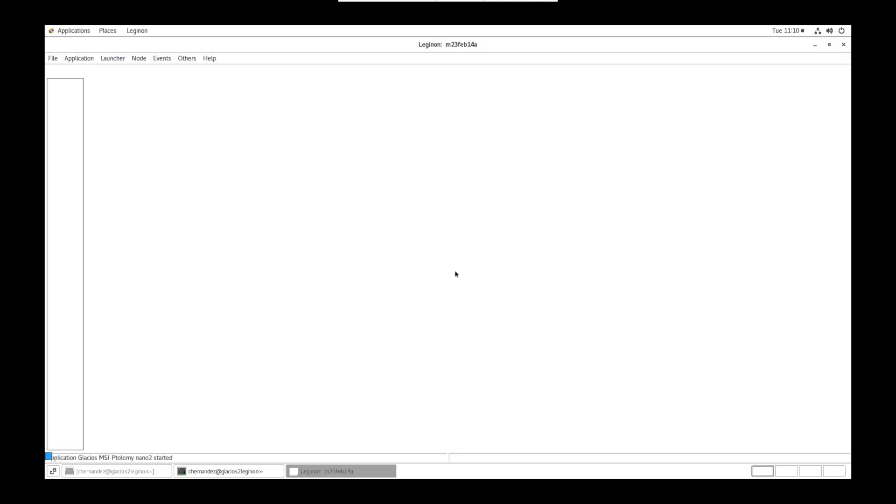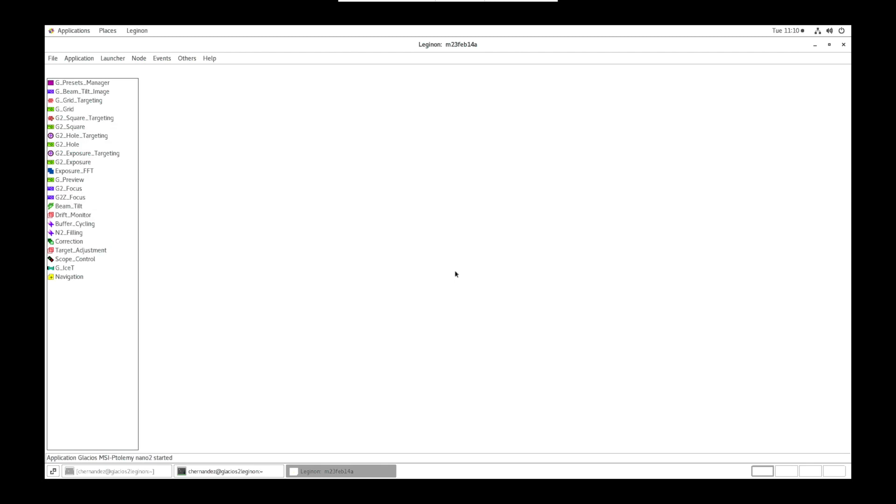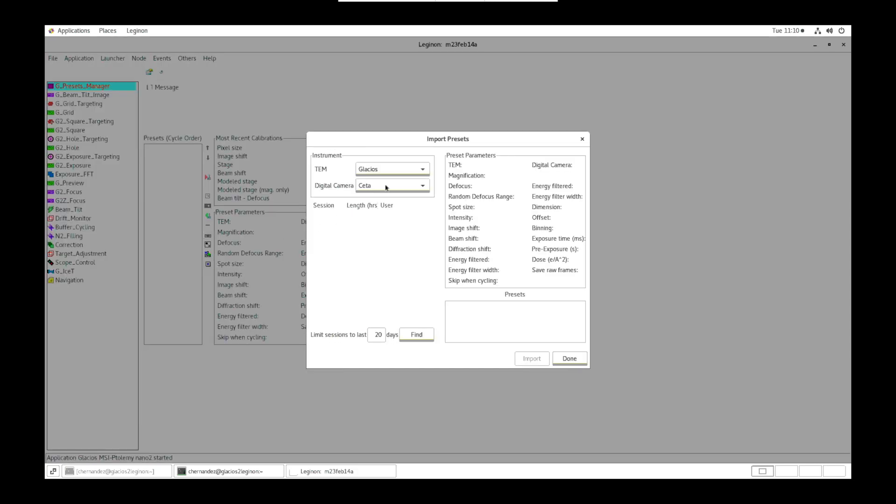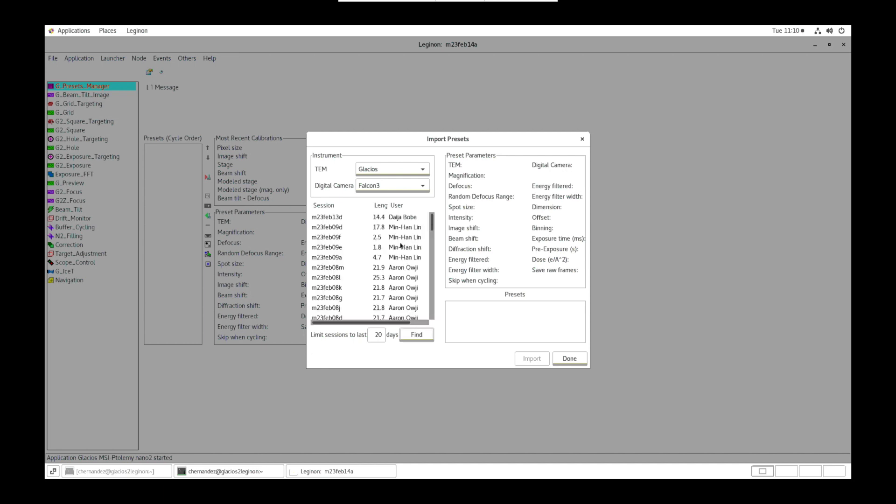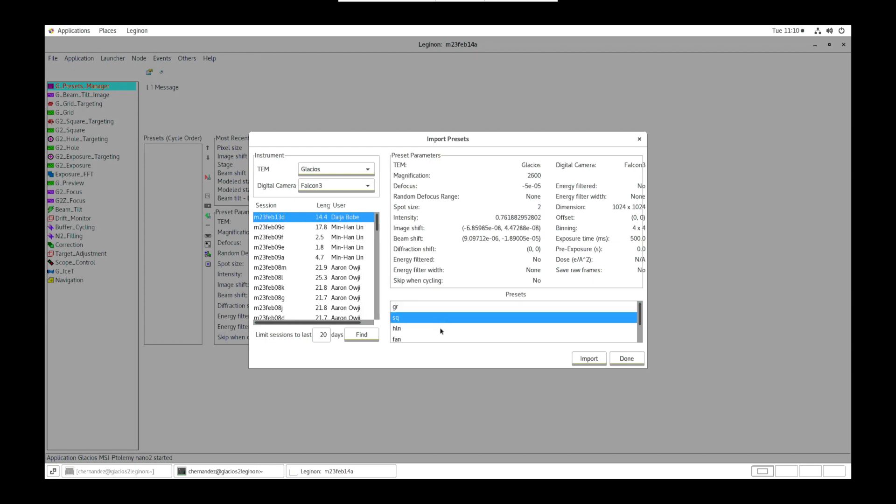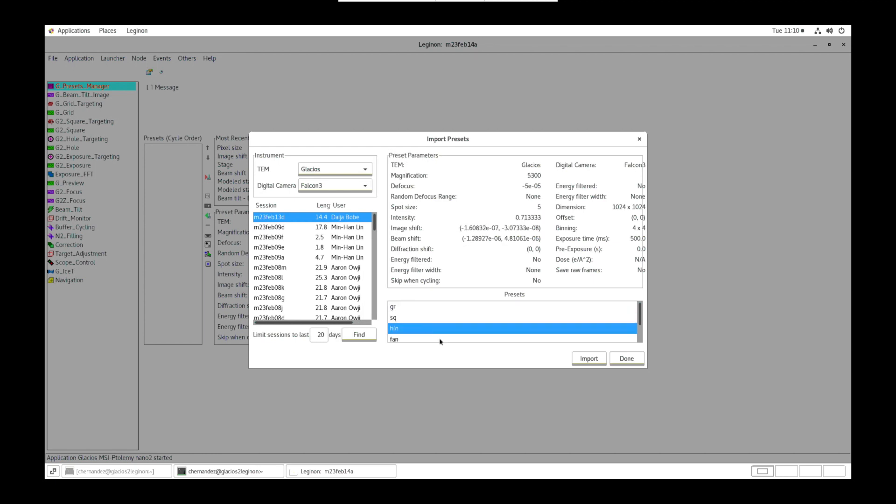Once the nodes are loaded, click on presets manager. Scroll through the options and click import presets from a previous session. The TEM is Glacios our digital camera is Falcon 3 and select find for limit sessions to 20 days.